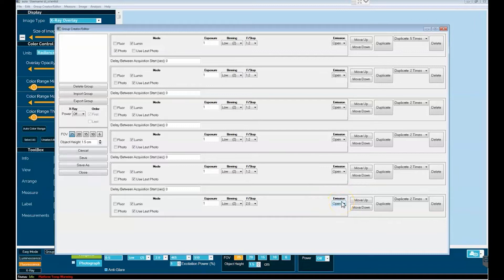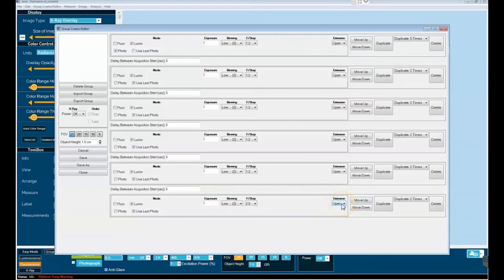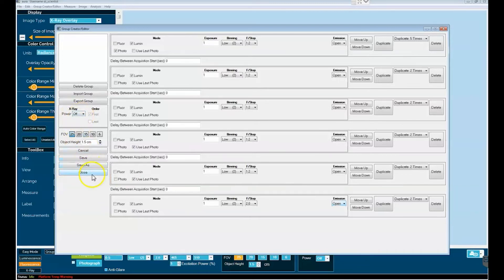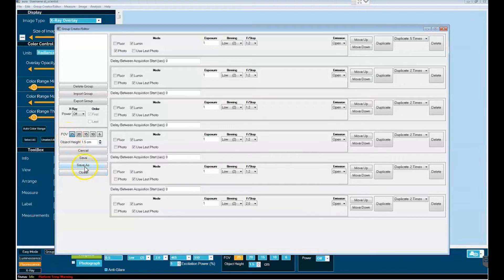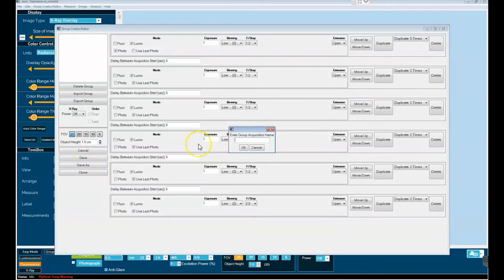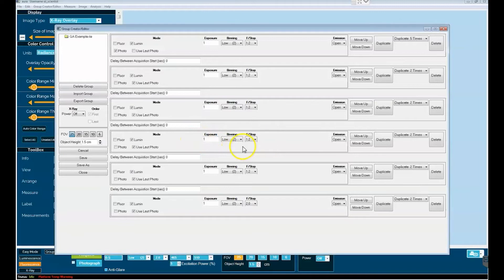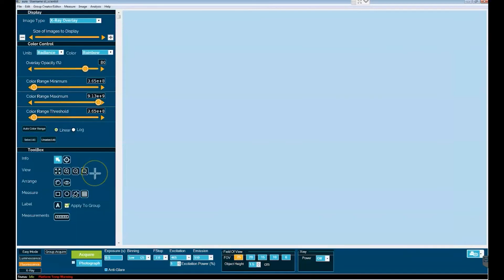If you'd like typically in bioluminescence you will not be using an emission filter. It will just be an open aperture to the camera. All right, so we will not use x-ray here. We will simply go ahead and use the 25 FOV and save as this and now close this secondary window.